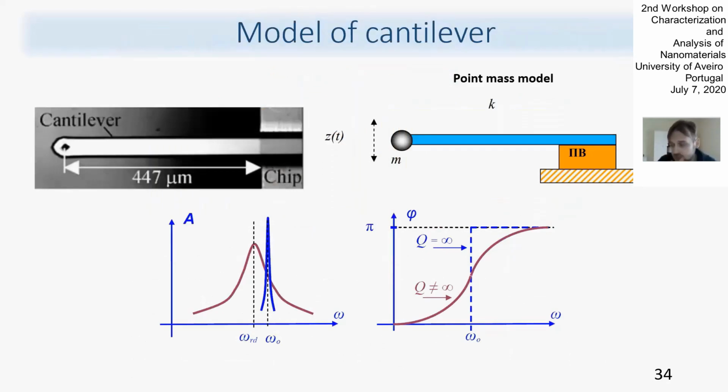And also, a very important point: in order to understand the tapping mode, we use resonance frequencies in order to excite our oscillations. So when we talk about oscillation of the tip, it's specifically done at a specific frequency of the cantilever. If we model the cantilever as a point mass model, just a very simple model, we will have one specific free resonance, and when you're measuring on this resonance, you really gain amplification of the signal, 100, 200, 300 times.